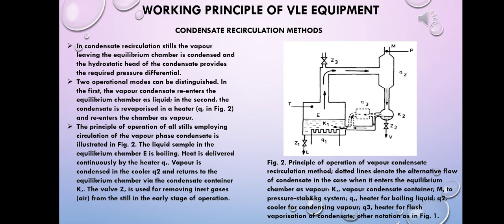Below is a video that demonstrates the procedure for the operation of the equipment for the VLE process.